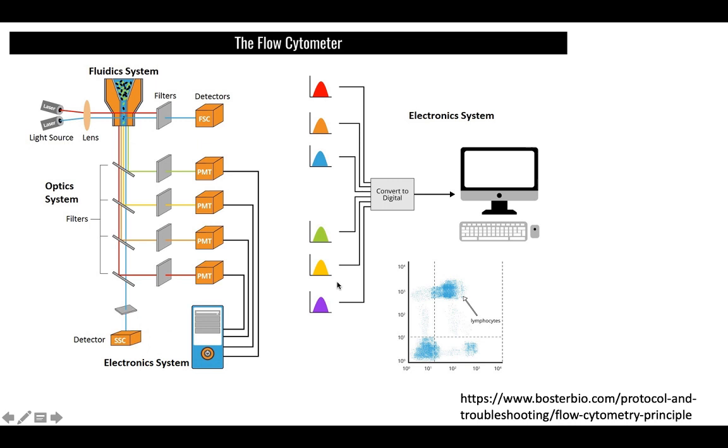The fluorophores, for example the one that I showed you earlier, the secondary antibody conjugated with the fluorophore, which looked yellowish in color. So the flow cytometer basically detects three things. And this is the premise of the whole experiment, the whole idea of the flow cytometer. Three things: the forward scattering, the side scattering, and the fluorescence intensity.